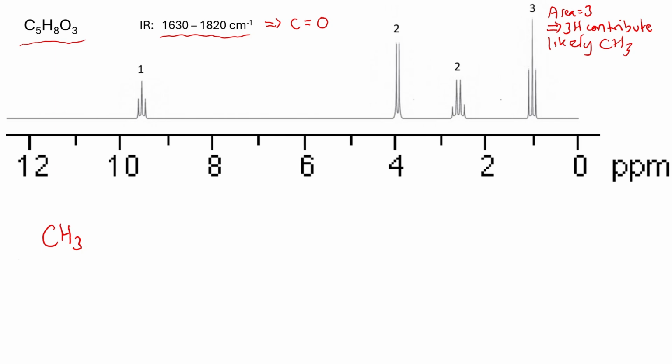What else does this peak tell us? Well, what about its chemical shift? Well, that's consistent with HCr. You can see the shift's about 1.0 ppm, and your data sheet tells you that's an HCr shift. And that just tells us that there's another carbon next door. Not an exciting one like a carbonyl or a benzene ring, but just some kind of bog standard carbon next door. So we can do that and say we think we've got that in our structure. Again, just from looking at this peak.